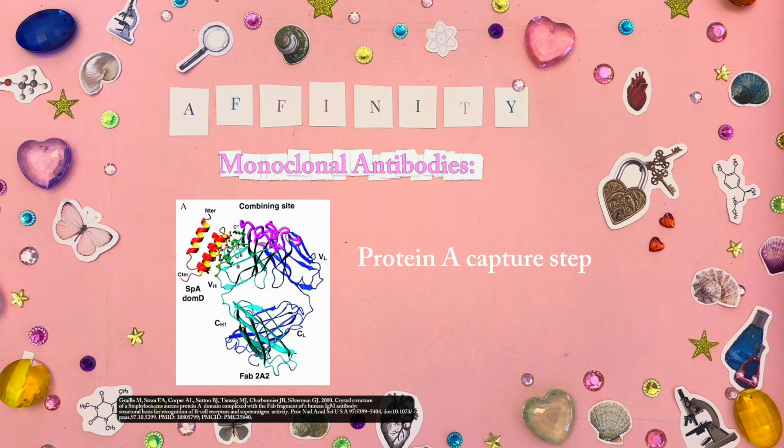In the previous section, I mentioned diseases being treated by monoclonal antibodies, purified with ion exchange chromatography. I actually found that many of these same treatments involved an affinity chromatography step beforehand. In the treatments for both breast cancer and inflammatory diseases such as rheumatoid arthritis, there's a protein A capture step, wherein protein A is immobilized on resin and binds to immunoglobulin G therapeutic antibodies.